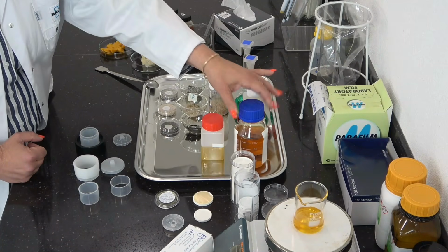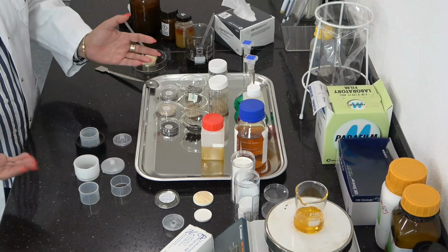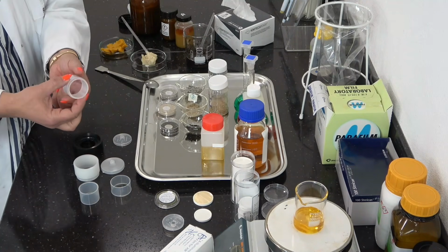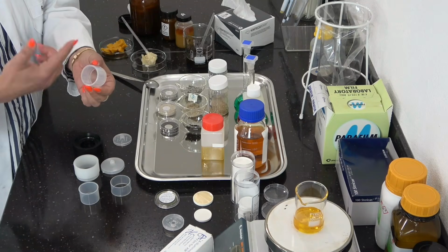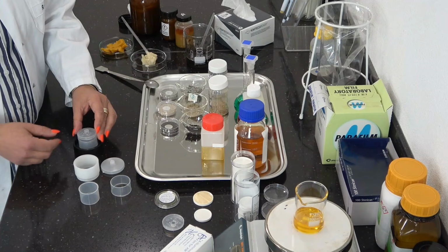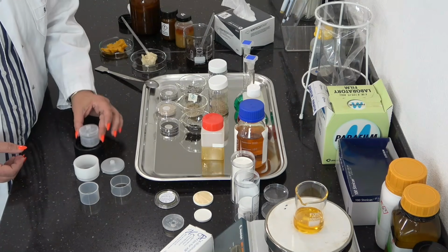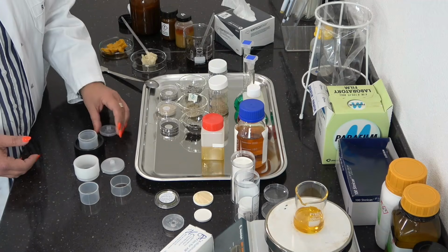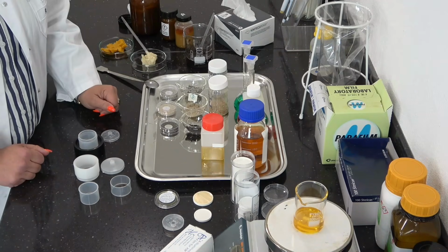So the easiest way is just to take a volume, 5 to 7 grams or milliliters of sample, and put it into the liquid cup. So this is just a cup stringed with a foil. Put the sample inside, close the lid, and that's it. And then you can start the measurement. Very easy and very common, but how to handle more complex samples?